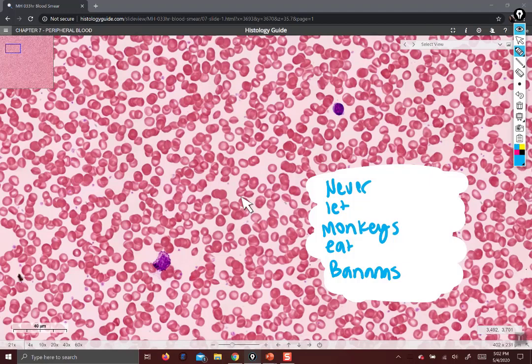When you look for basophils, you're looking for something dark purple. This lymphocyte fits the bill, but it's too small and not granular enough. This guy is your basophil. I like having them in the same field of view because you can see how much larger and chunkier the basophil is than the lymphocyte. So this is the basophil, and this is the lymphocyte.